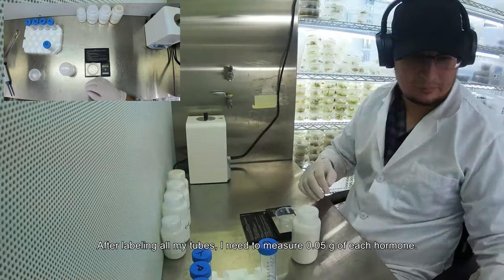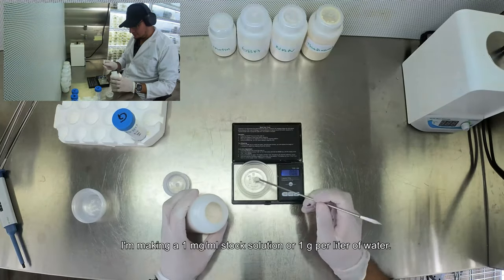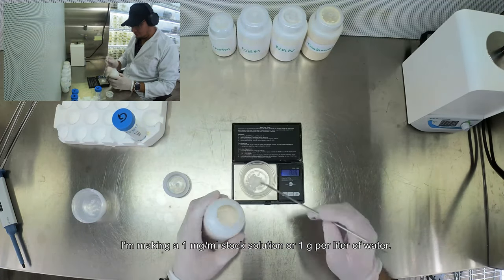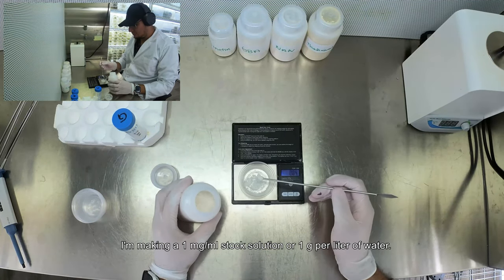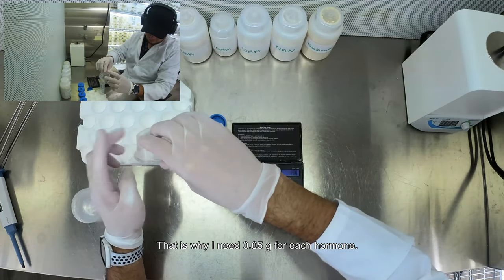After labeling all my tubes, I need to measure 0.05 grams of each hormone to make a 1 mg per ml solution, or 1 gram per liter of water. That's why I need 0.05 grams for each hormone.